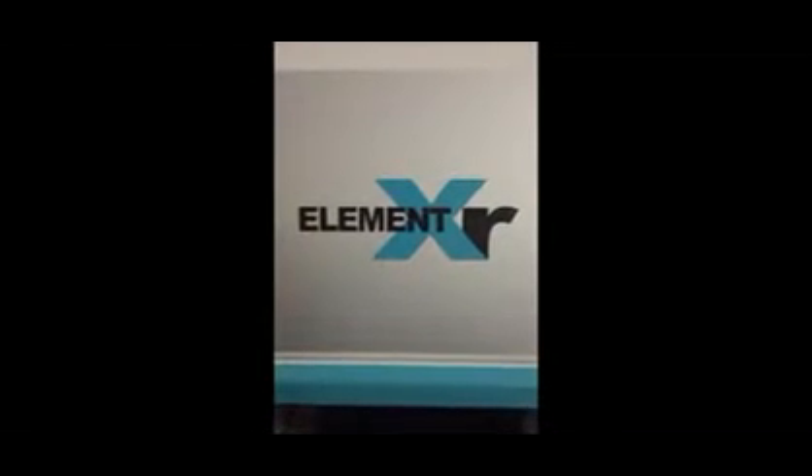Hello, today we're at the main facility at Eastern Applied Research, previewing one of our newest XRF instruments, the Element M5, also known as the Element XR5000.